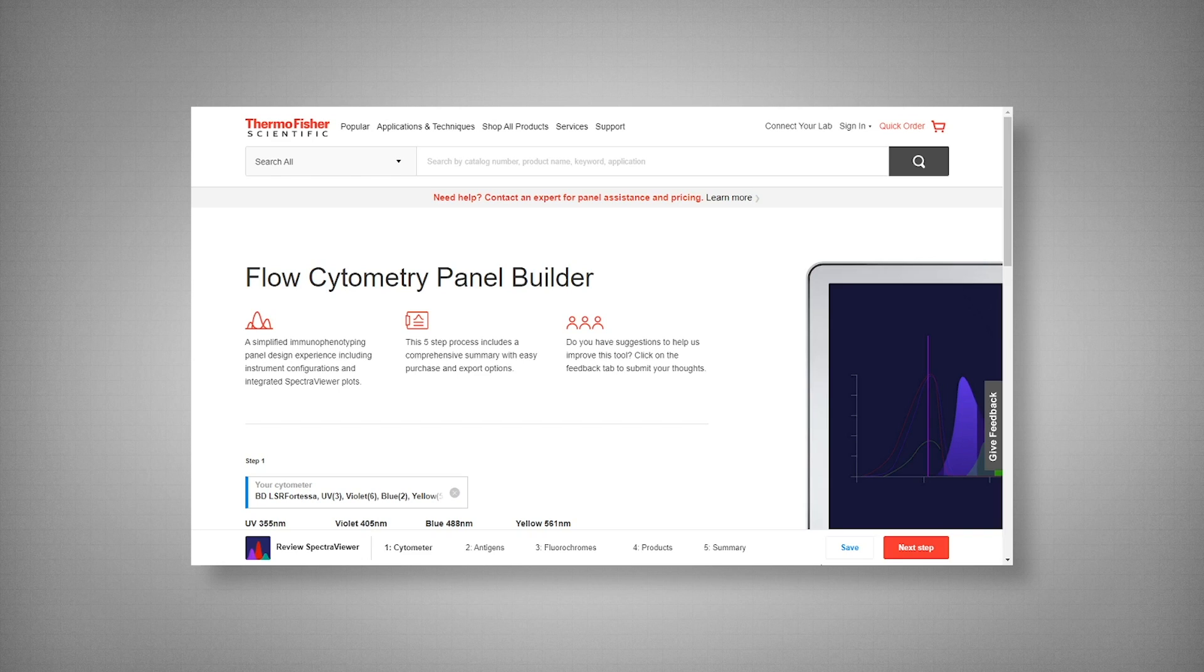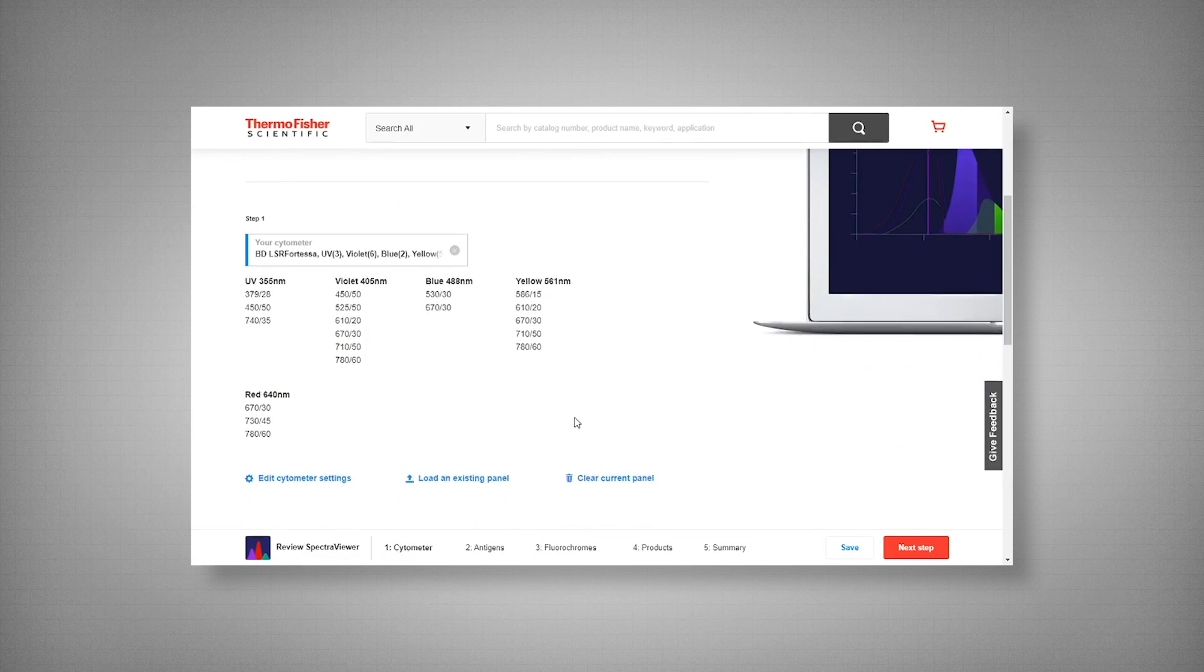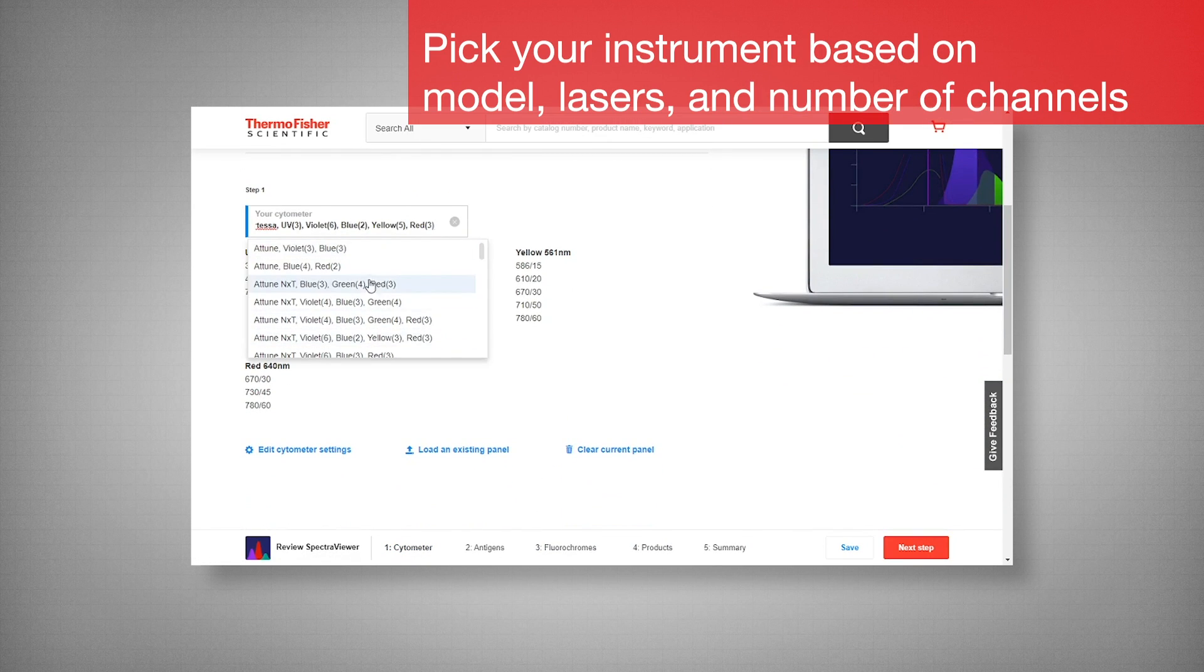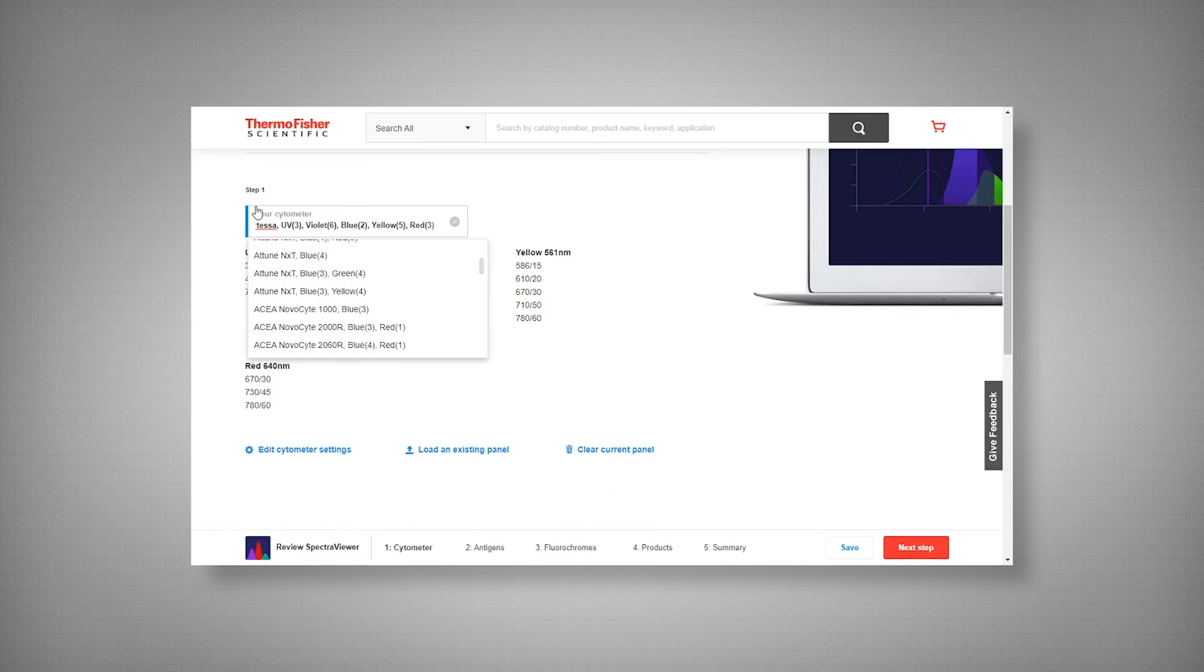Our first step is picking our instrument with the appropriate laser and channel configuration. Now one thing to note here is that while there is an extensive list of instrument options, you can filter by typing in your cytometer name.